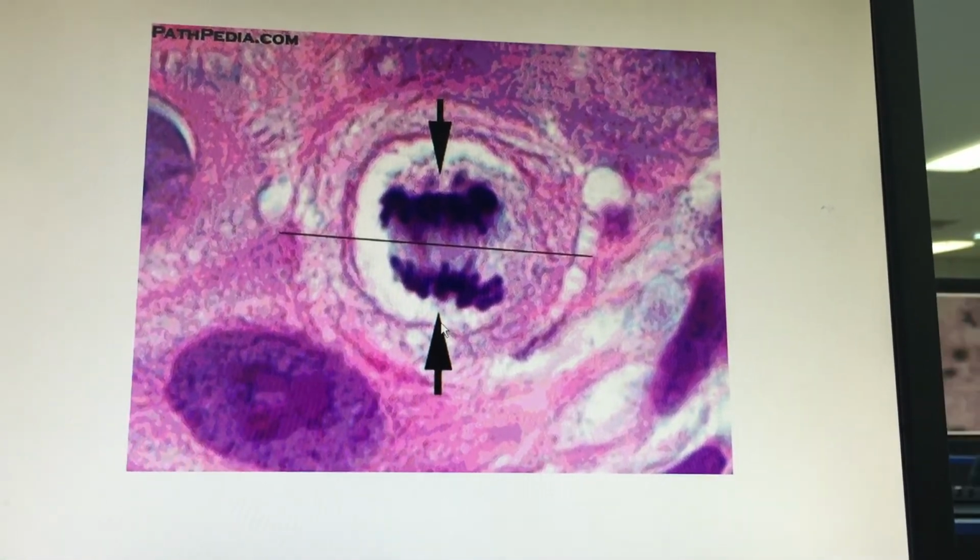Anaphase, that's right, in an animal cell. Here, what about here? Ana or telo? Telophase. They are not only separated, they start to form masses again. They are starting to decondense once again. This is a telophase in a plant cell. Can we see a cell plate in here? Not yet. Maybe cytokinesis did not start yet, but as you know, cytokinesis always overlaps telophase, but not at this moment. It will be followed by the formation of the cell plate.